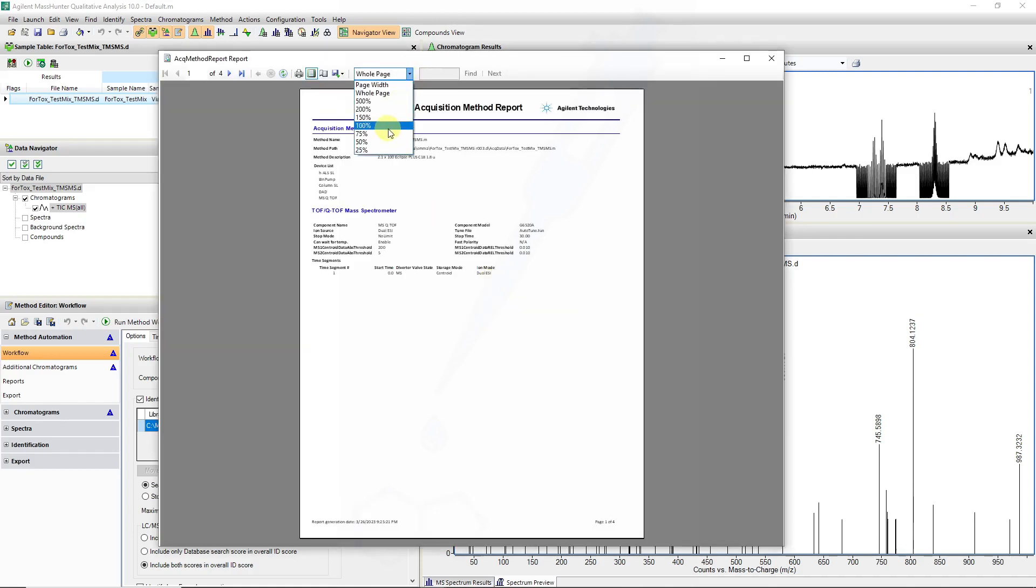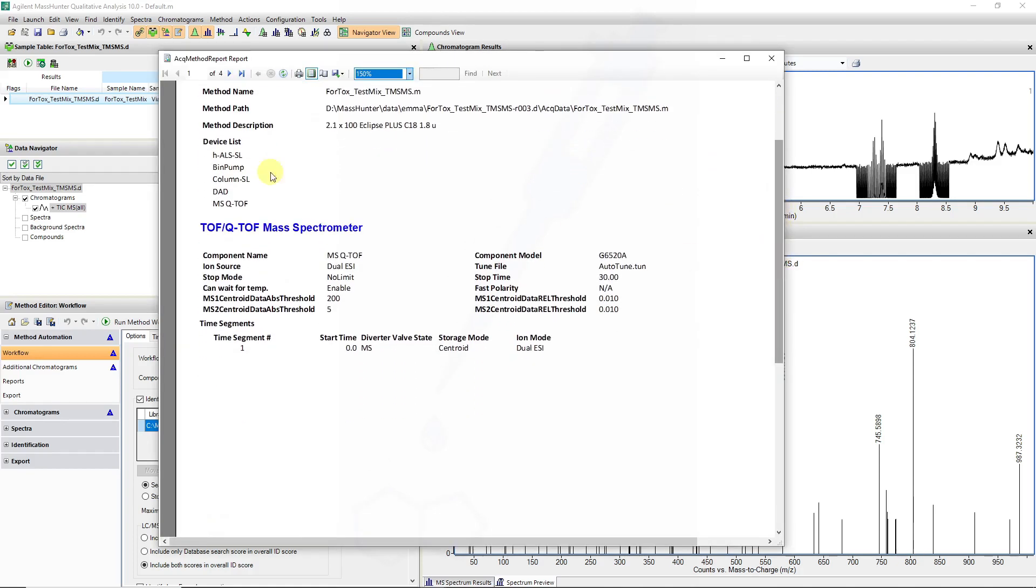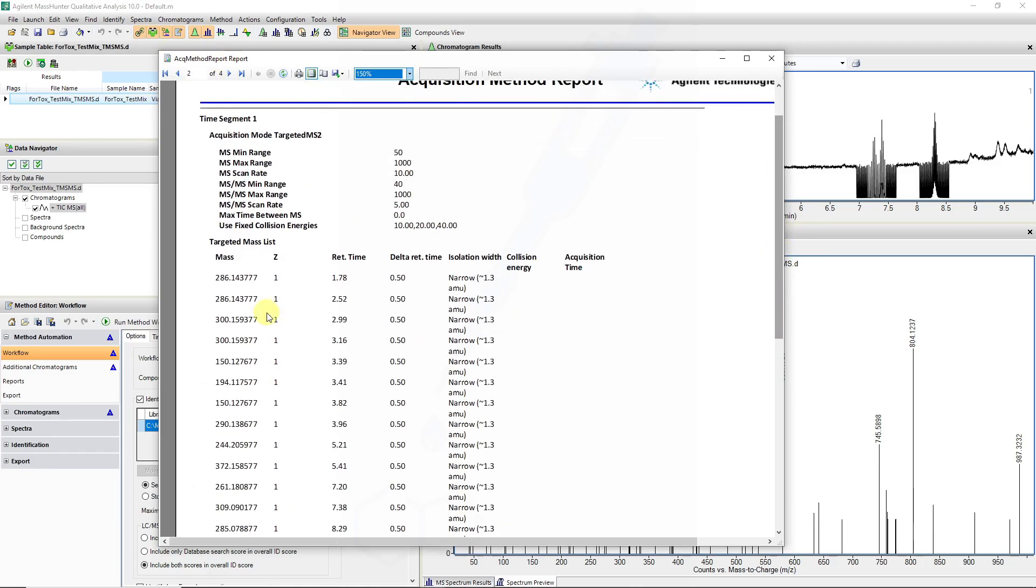If we look at this particular method, we can see that multiple entries have been added. There is retention time specified as well as a delta retention time, an isolation width for the quadrupole, and discrete fixed collision energies were used at 10, 20 and 40 during acquisition.